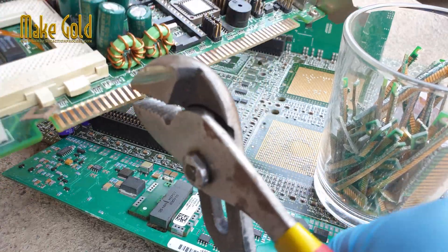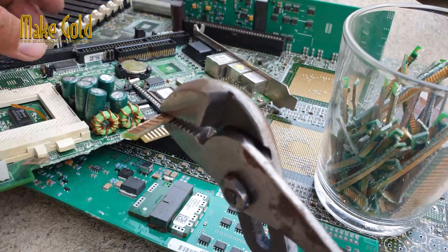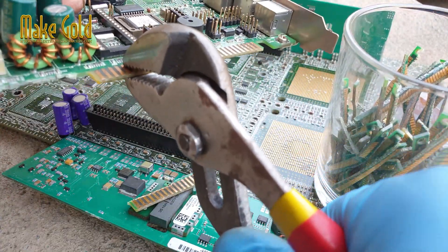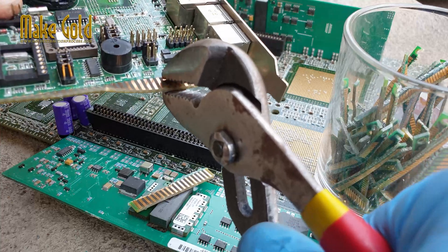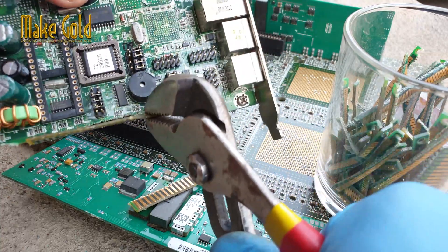PCB gold fingers are valuable because of their gold content, which can be extracted and refined for use in other electronic components or sold as scrap metal. Extracting gold from PCB gold fingers using nitric acid can be straightforward, but the process requires care.